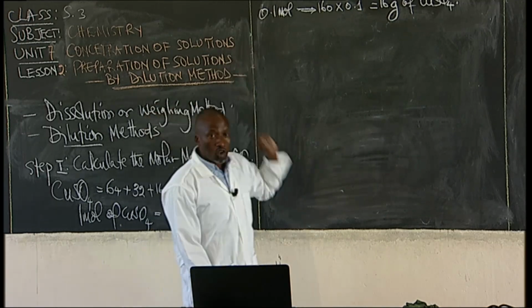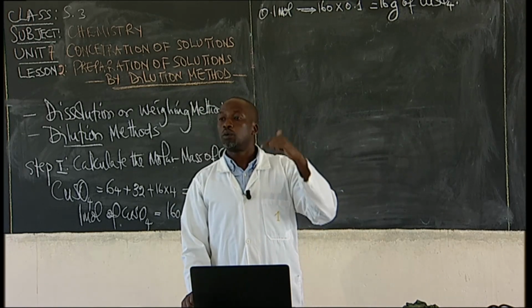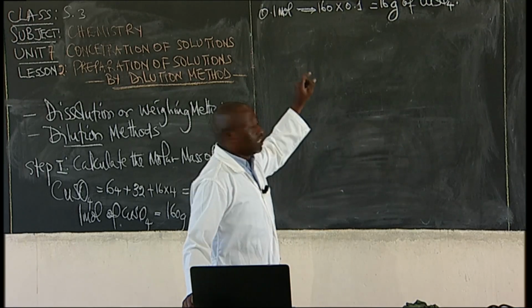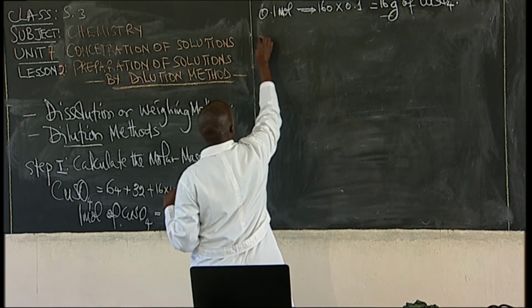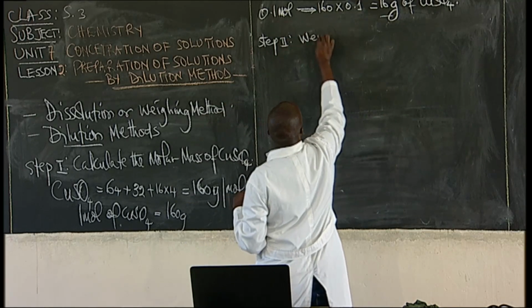And this 0.1 mole, remember, it is in 1 liter. So that means 0.1 mole, that is the molarity, it was in 1 liter. So what you do, that is the second step: weigh.